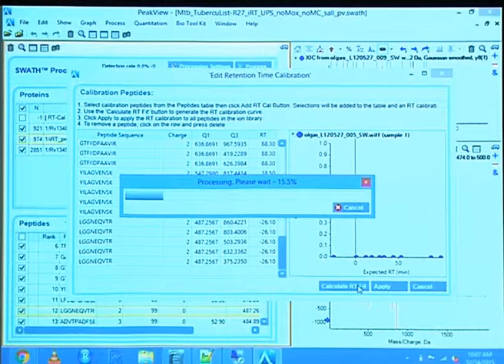You won't identify as much as you will with the retention time specified in there. You also will use the entire chromatogram, so it will take a much longer time to extract. But in the end, you will find essentially these assays that are identified very easily.